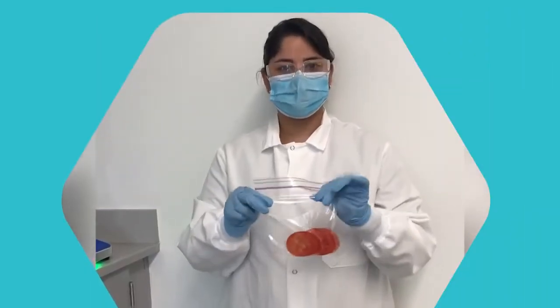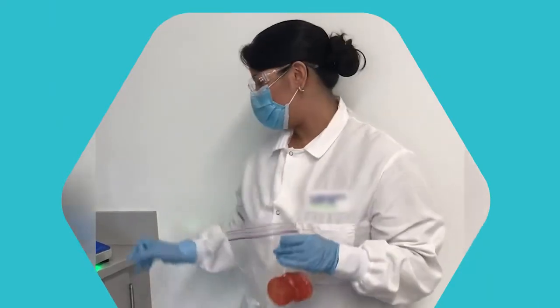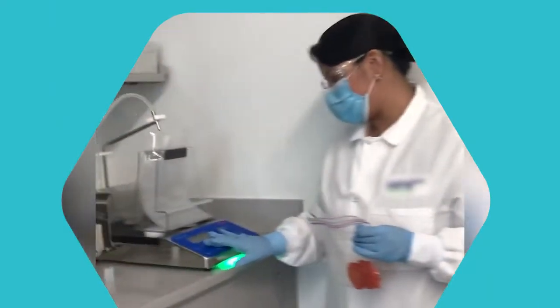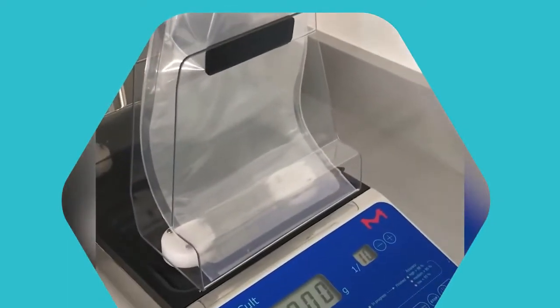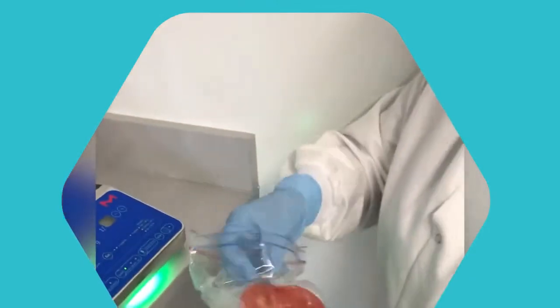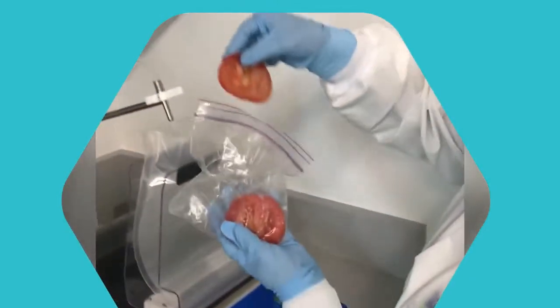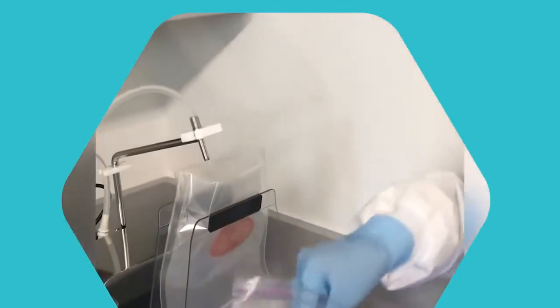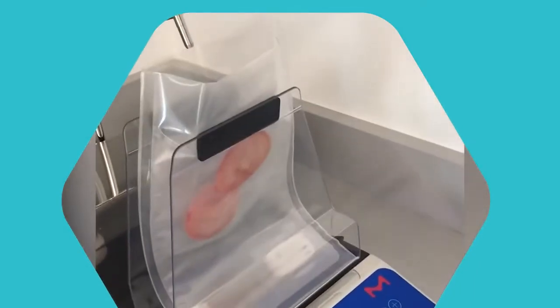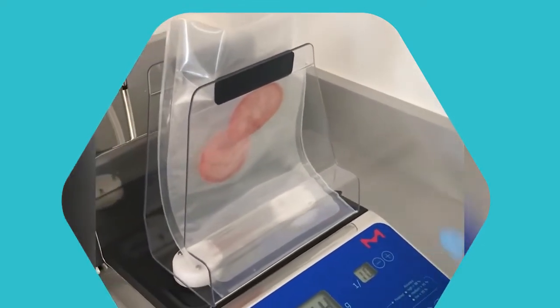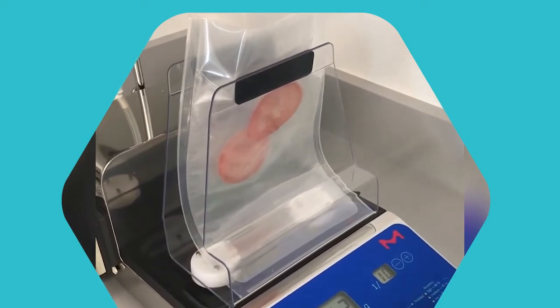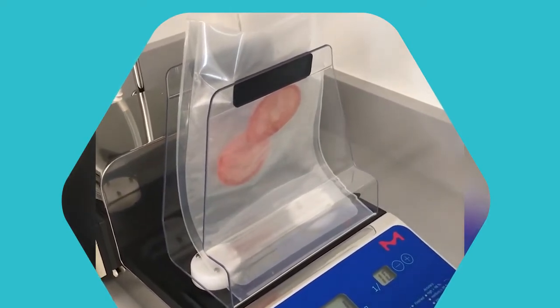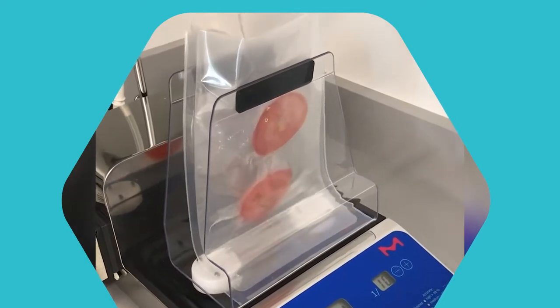Now we're going to start diluting our samples, our tomatoes. So we're going to start taring our equipment, the diluter. Once it's taring, I'm going to add my samples to this. Two slices of tomato. It's going to give me one to ten dilution, which is like tenfold. And all I have to do is click go. It's going to add buffer to it to dilute.